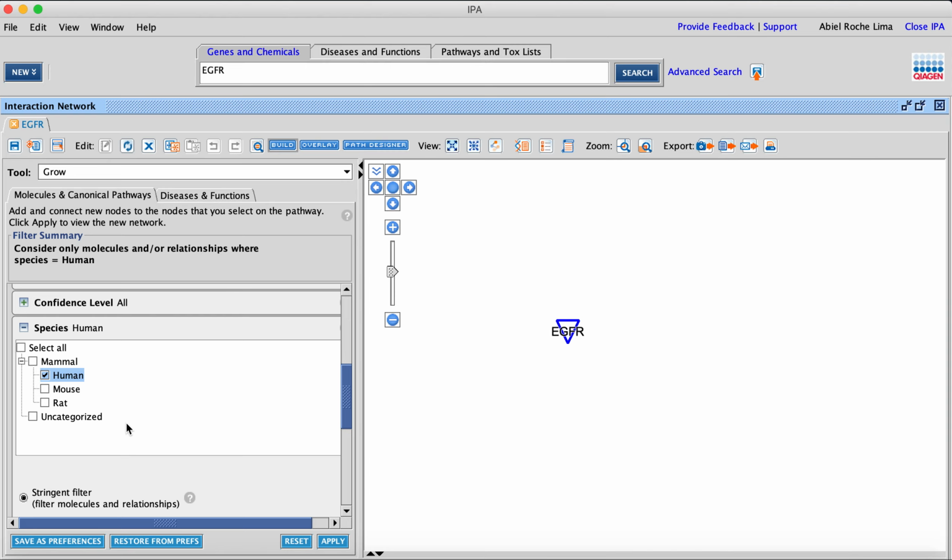Literally says, well, we're going to find orthologous proteins that are similar but in other organisms. Or let's say that you have other organisms and you want to say, well, I have this list of significant proteins from yeast, from a parasite, let's say Plasmodium berghei. And you have a list of proteins specifically for that particular organism, but you want to see if that list of proteins are orthologous in human, mouse, or rat. So that's a way that you can do it.